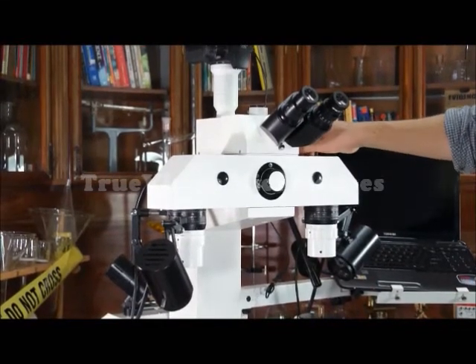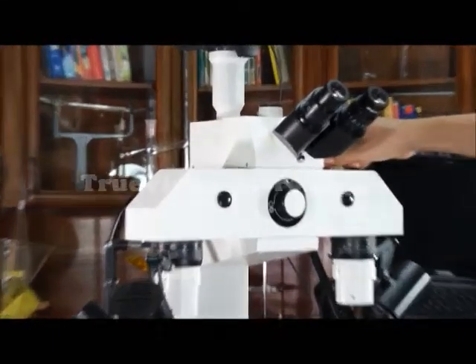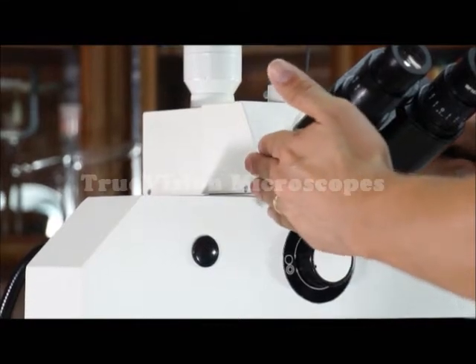There's a trinocular lever on the other side where you pull out, and it takes the image to the camera.